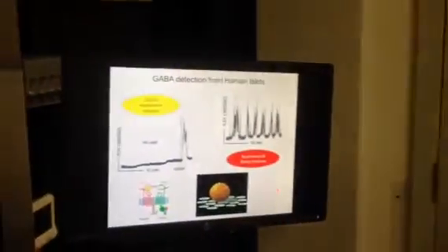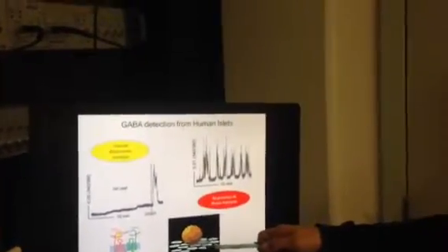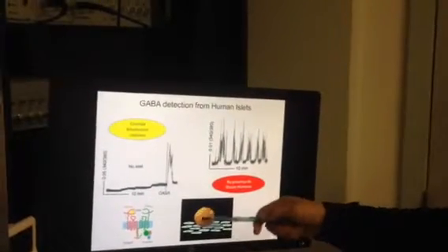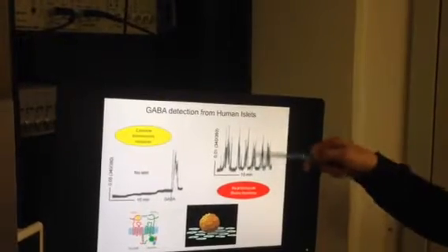Look, in the presence of islets, when I put the islets on top of these biosensor cells that are sensitive only to GABA, I found out for the first time that the GABA release from the human islets is constitutive and rhythmic in this system. So this is what happened when you put the human islet on top of the biosensors. They start releasing GABA without any kind of stimulus, and the biosensors can sense the GABA from the human islets, and they show you that this GABA is released just as insulin is released, every 4 to 10 minutes. It was a very interesting finding.